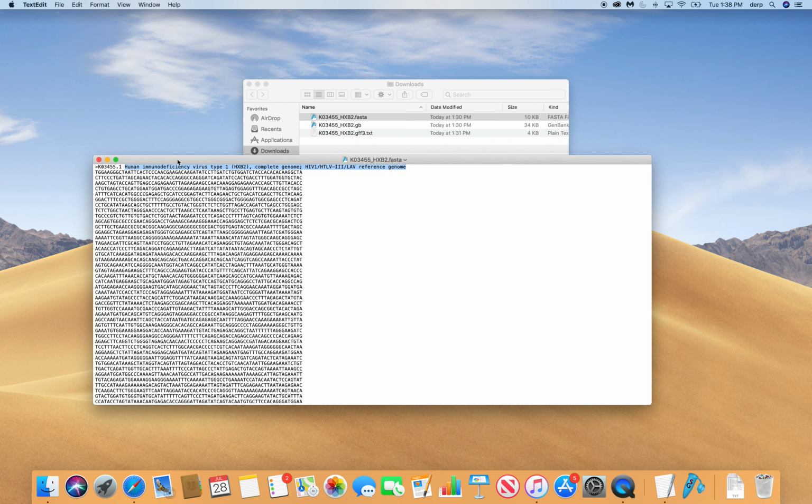We chose a different way of naming it compared to this, in part because this is kind of long and annoying to deal with. This is nice and short, and we can actually use this to compare a bunch of other sequences quickly without having to change our windows or anything like that. And so the next line immediately is the first sequence, and there are many different types of FASTA formats. Sometimes you can just have the full length of the sequence in one line, which is annoying to look at. This is just a very easy way of looking at it.